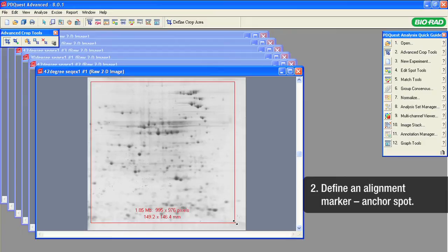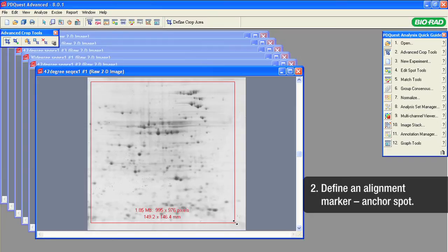In the process of cropping the images, we will point to this anchor spot in every image and the software will align the entire image set by this anchor spot position.